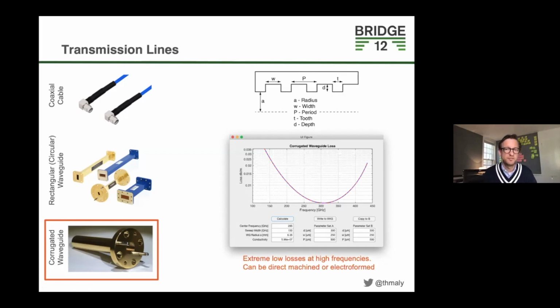That is fantastic. This is why these corrugated waveguides are so popular, to really ensure efficient microwave transmission from your source to your sample. And at 1/2 inch or 3/4 inch, which is almost 20 millimeters diameter, they are not that difficult to machine. And you can also think of, instead of really doing a corrugation, you can tap them. The performance is comparable to a corrugated waveguide.